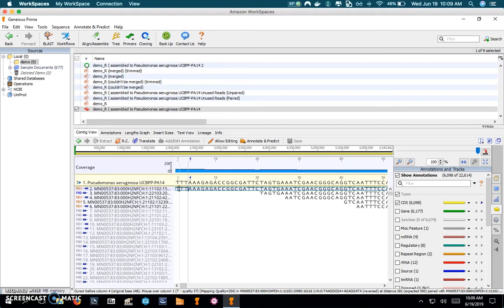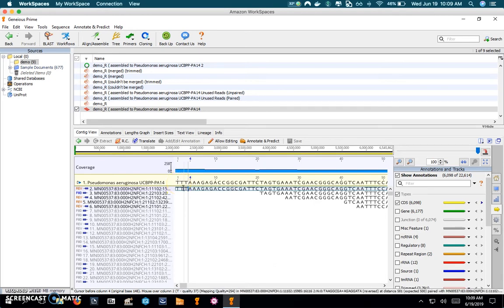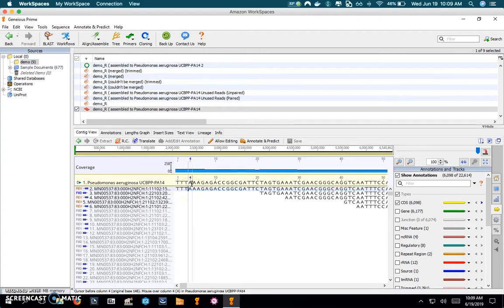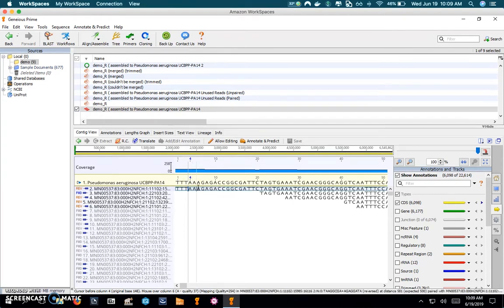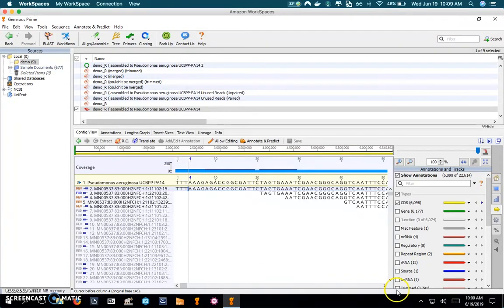You can see that the first locus is thymine and it maps to thymine in the reference genome. The second is thymine, it maps as well. The third is thymine, the fourth is adenine, it also maps to the reference, and then adenine, adenine, guanine, and so on. You can see it's mapping perfectly all the way across the read.